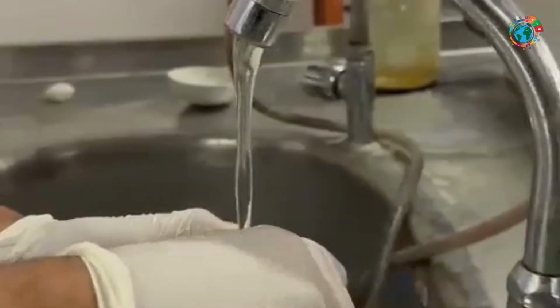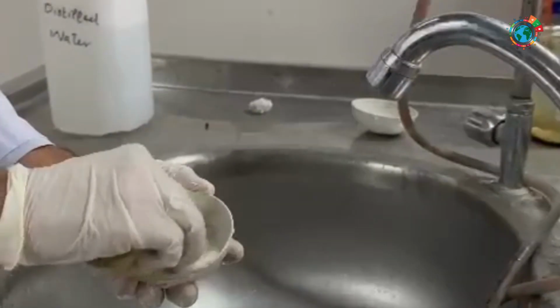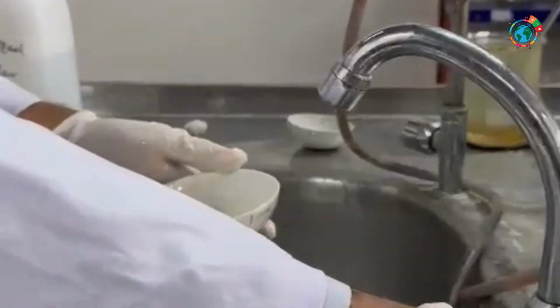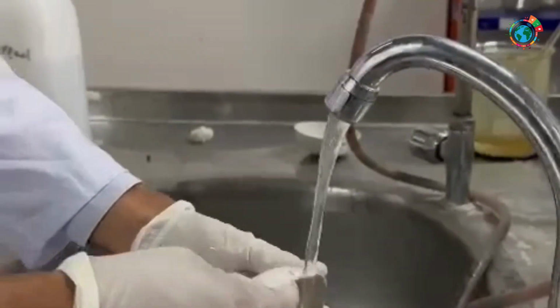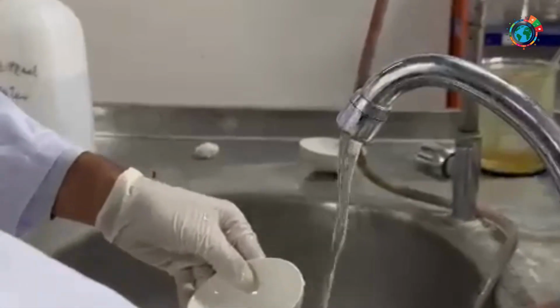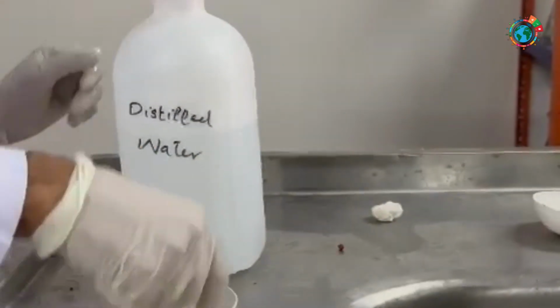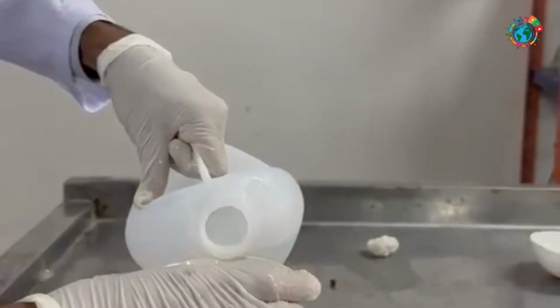For this, first of all, wash the China dish thoroughly with tap water followed by applying appropriate detergent or dishwasher available in the laboratory. After the application of the detergent, again wash the China dish with tap water to remove residual unwanted materials like dust, dirt particles, and detergent residues. Finally, wash the China dish at least thrice with distilled water to ensure proper cleaning.